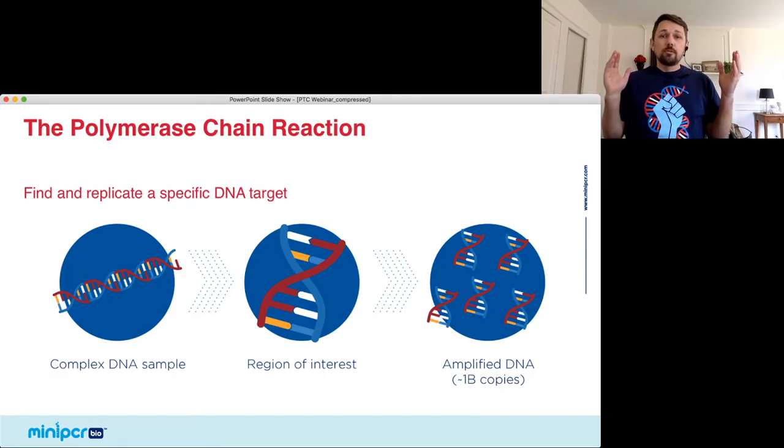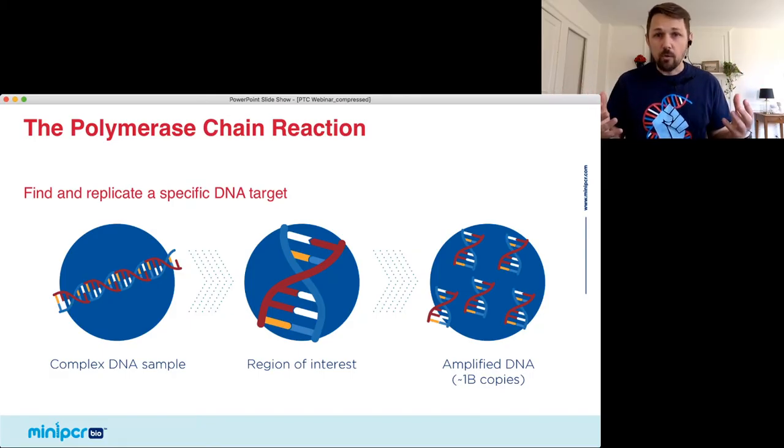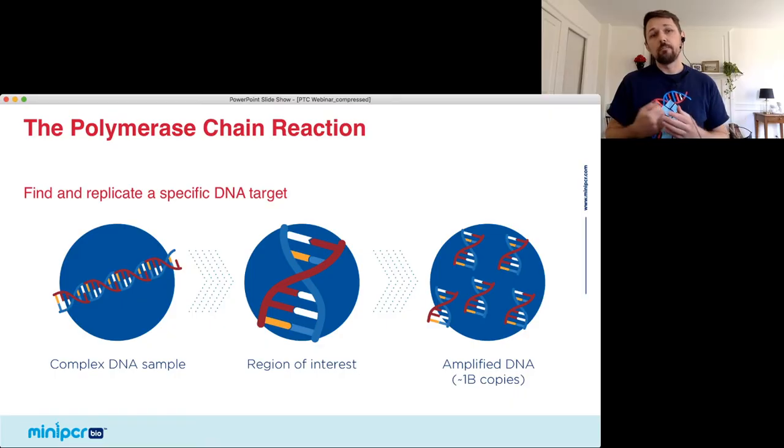So to find that gene and to figure out what you are, we have to do a process called PCR, the polymerase chain reaction.